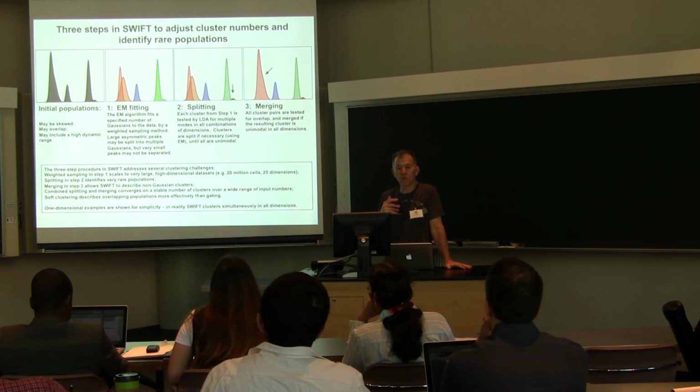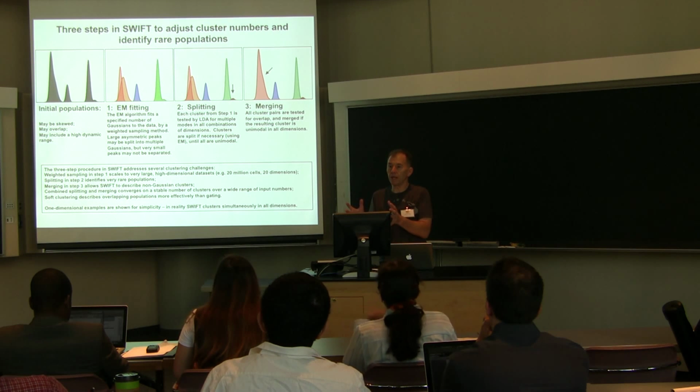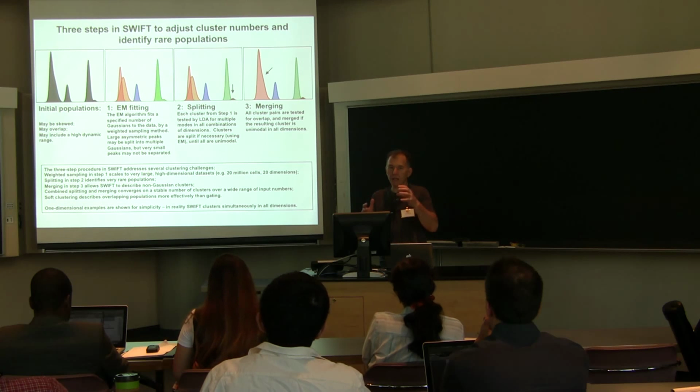So what they designed was an iterative process where, first of all, a small sample of cells is taken, and that small sample is clustered, which defines some of the major clusters. Then they go back into the data and take a new sampling, but this time they use a lower probability of sampling from areas that have already been identified as clusters and a higher probability from areas that are more sparse.